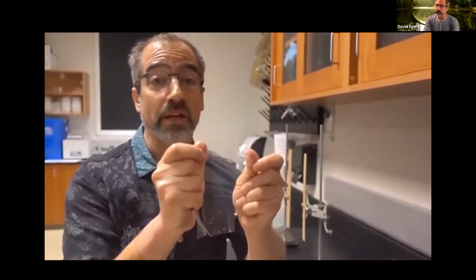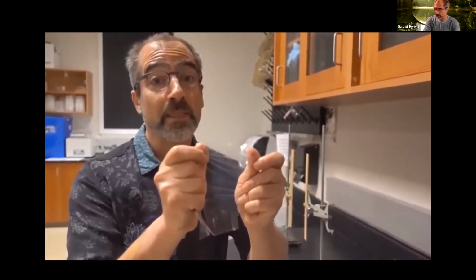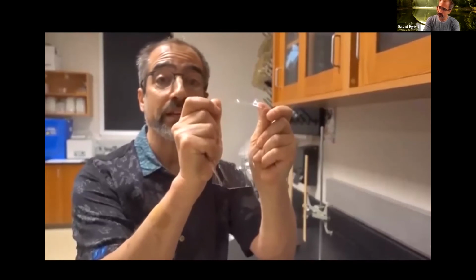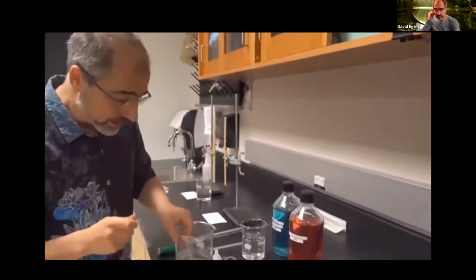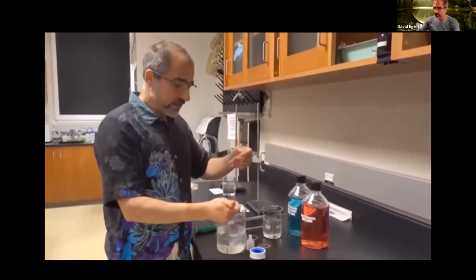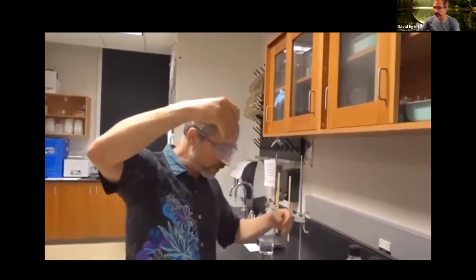We're going to have different concentrations of sucrose solution, which is sugar water. With the sugar water in this membrane, the water can move across from one side to the other, but the sugar molecules are trapped on whichever side they're already at. So we're going to take this. I have a prettier one that I already cut up here, and I've got my little square of dialysis membrane.